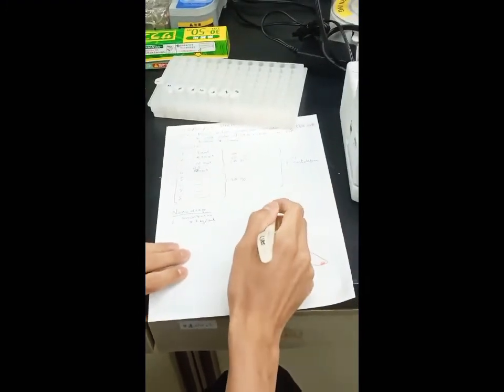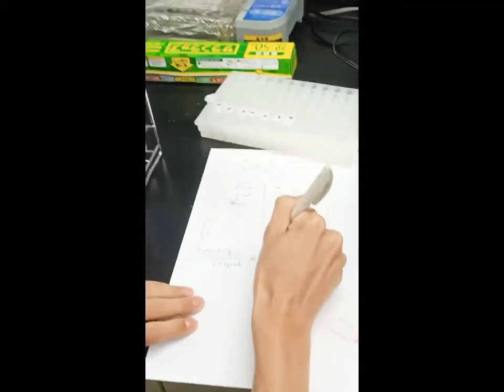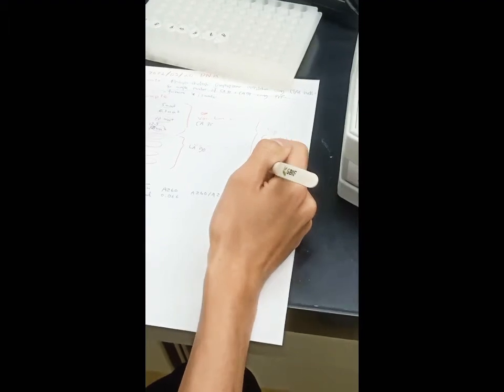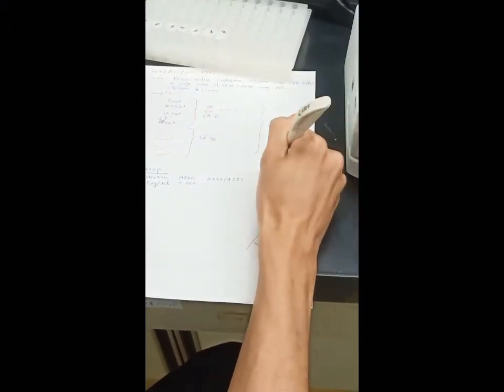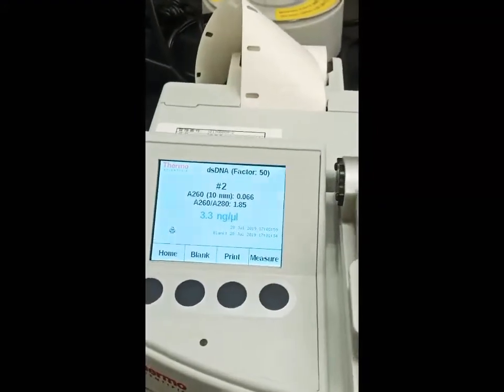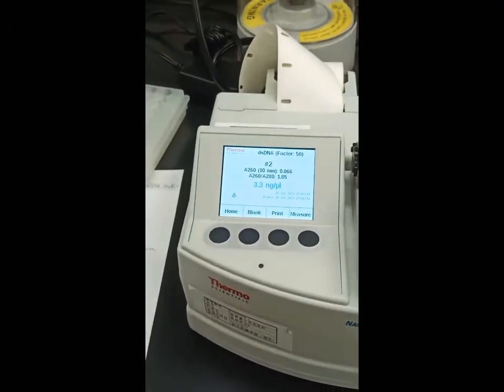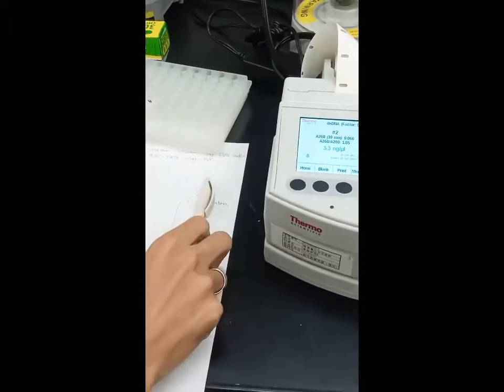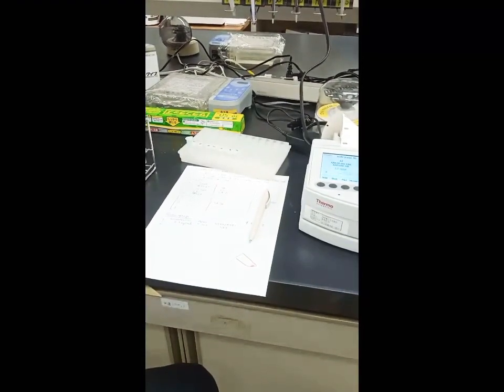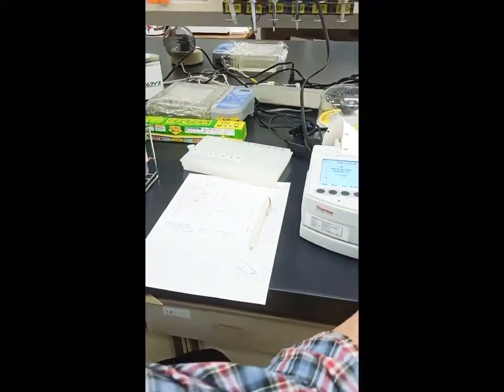The concentration is 3.3 nanograms per microliter. The important value here is the ratio — the normal range is between 1.8 to 2.0. A value of 1.8 to 2.0 indicates good quality DNA. This sample shows 1.82, so this DNA is good quality, but you should still confirm by trying the PCR.